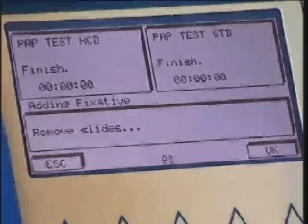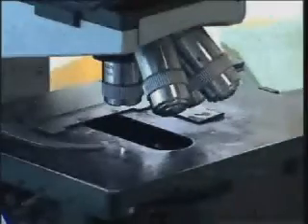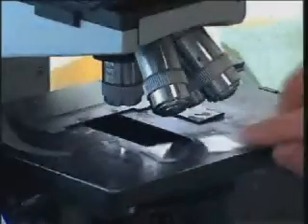The whole process for performing two tests takes less than two minutes. Let's look at some slides.